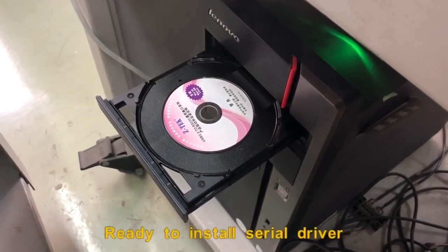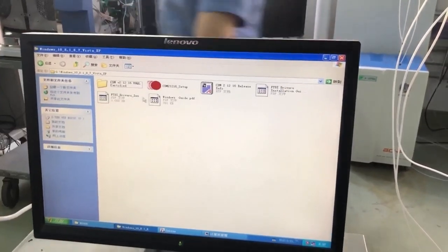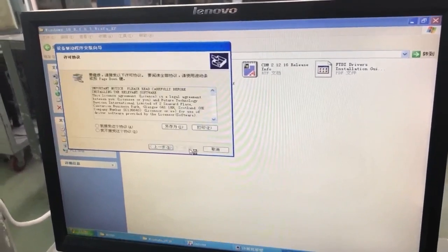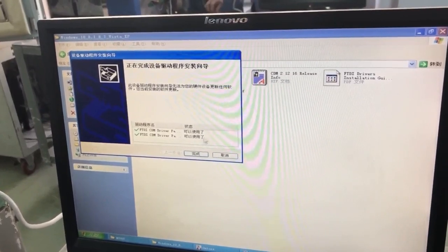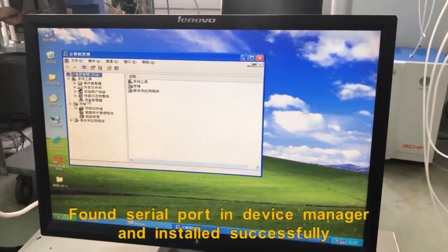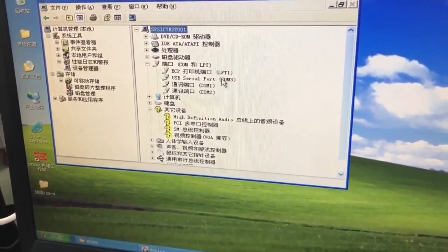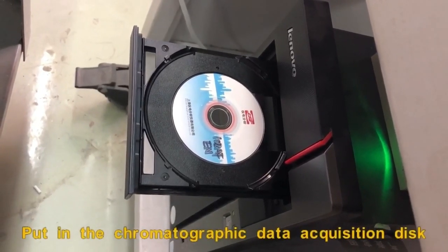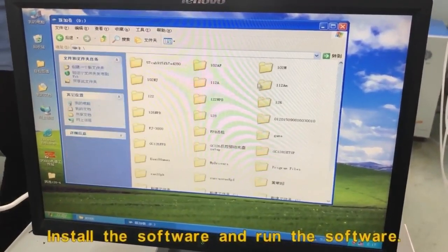Ready to install the serial driver. Click the CD button and select Install. Find the serial port in Device Manager and install it successfully. Put in the chromatographic data acquisition disk.